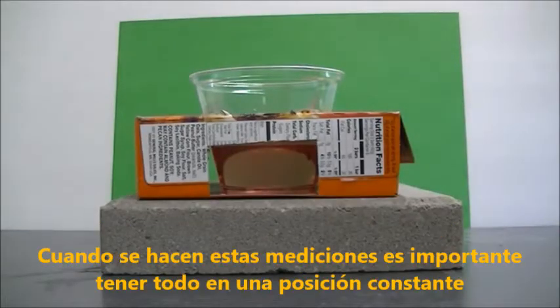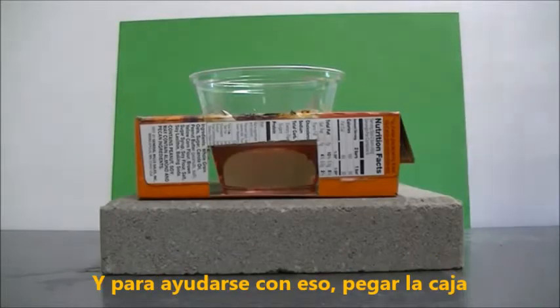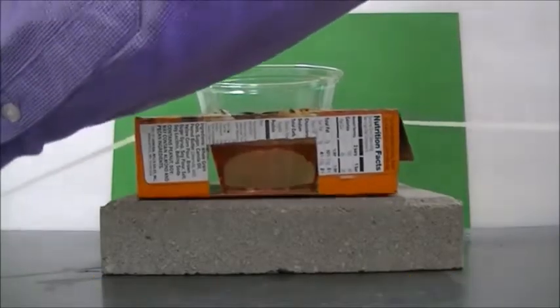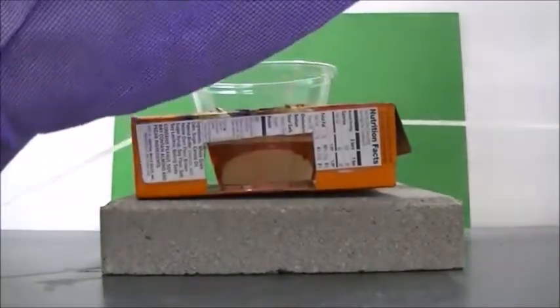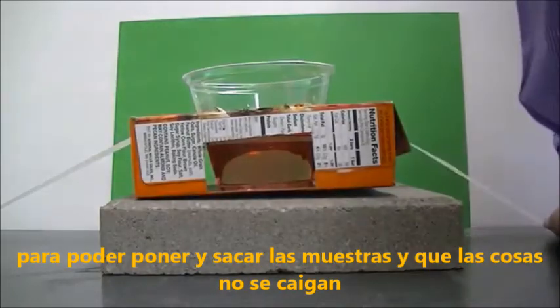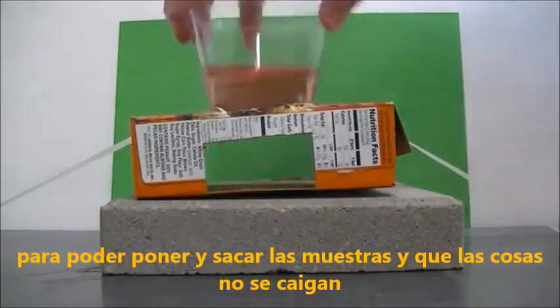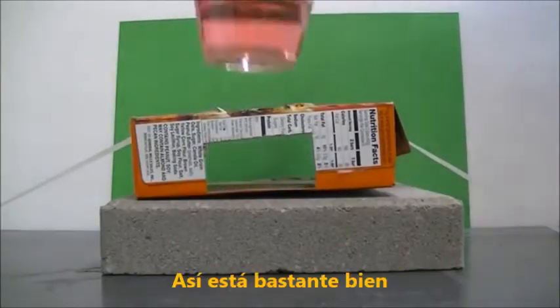When taking these measurements it's important to keep everything in a consistent position. To help with that, I'm just going to tape down the box so that I can put samples in and out without things getting bumped around a whole lot.